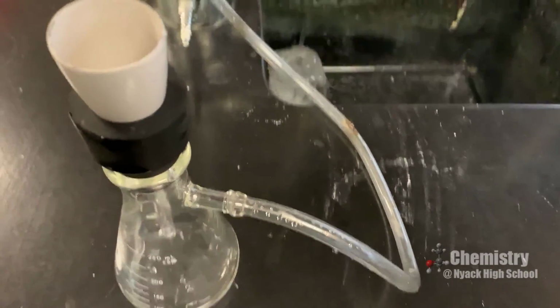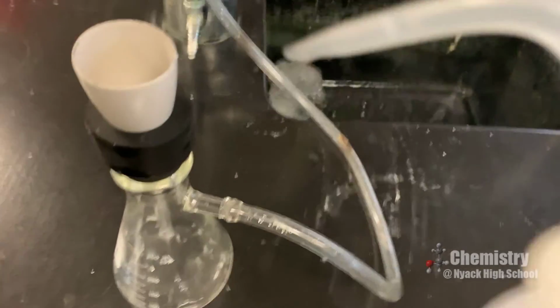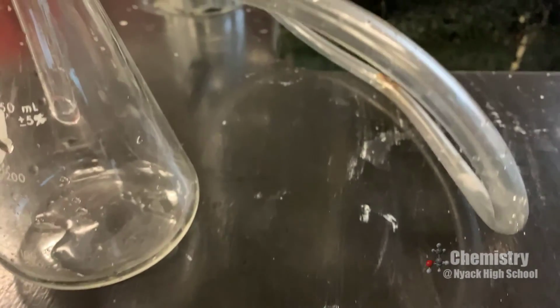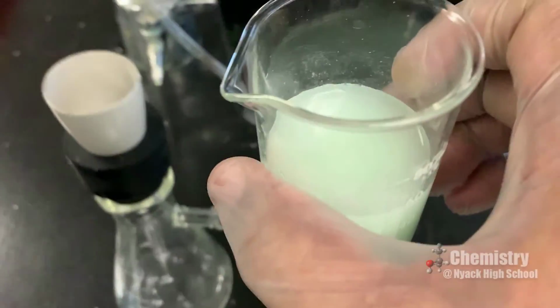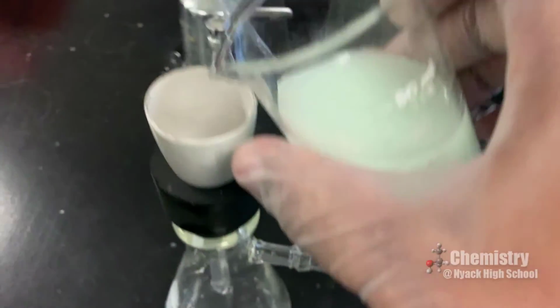Okay, so as before, I have my Gooch crucible and filter flask and aspirator ready. Just going to make sure the filter paper is wet to give it a good seal. Notice that it's pulling the liquid through, and make sure that's got a good seal. Okay, now I'm going to begin filtering my silver chloride precipitate.